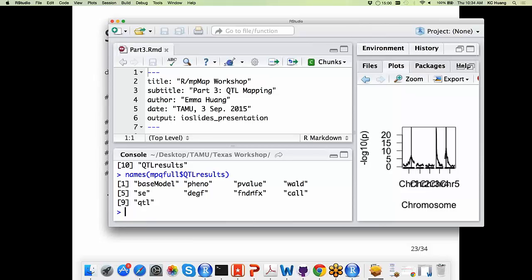When we do the summary of this, it pulls out those values for the specific QTL so that you don't have to go searching for them, but it is there for every location on the genome, actually. So if you rerun find QTL and produce a smaller or bigger set of QTL, it can go back and get that information for you.